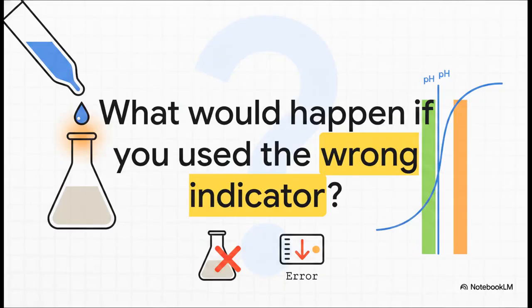And that leaves us with one last, really important question to think about. We know how critical the indicator is for signaling when to stop. But what would happen if you used the wrong one? An indicator that changed color way too early or way too late? Would the concentration you calculate end up being too high or too low?